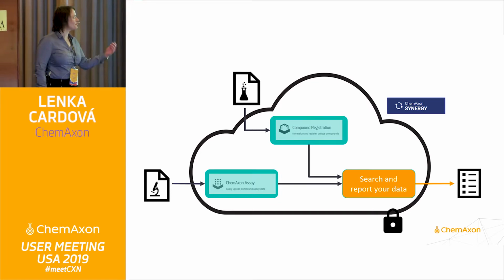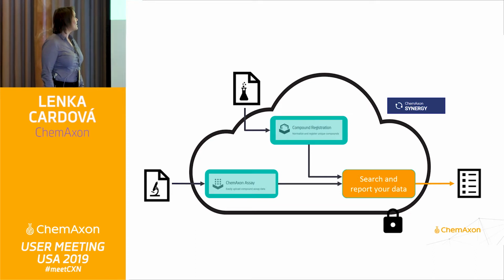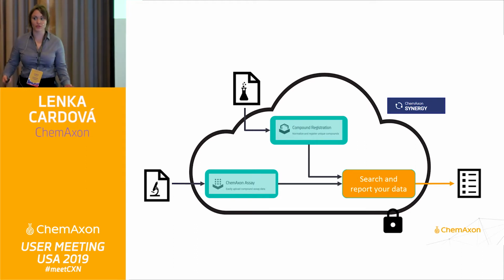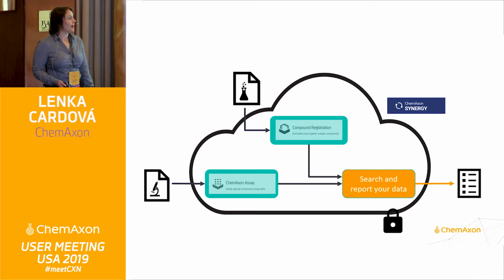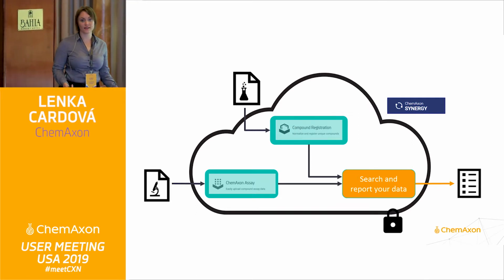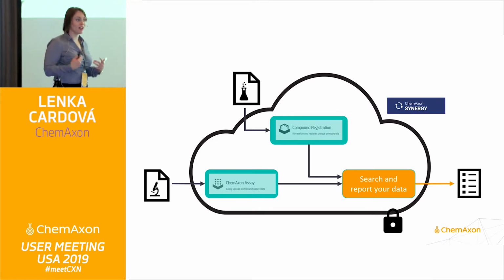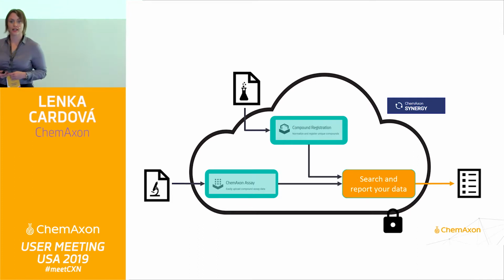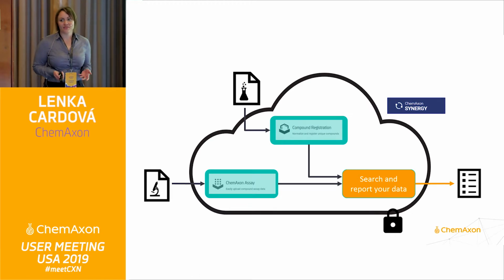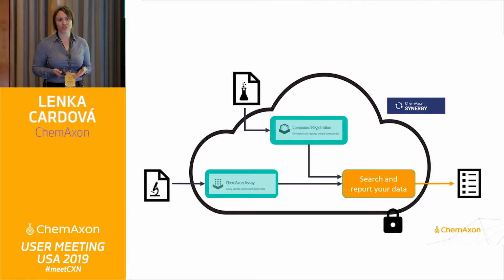Early in the morning, my colleagues Roland and Norby spoke about the compound registration and the way how to register your novel data, your novel compounds. Right now, you heard from Miklos about the way how to register the results of Assay screenings. Csaba, before Miklos, spoke about the synergy, one platform, one place where you can actually see all these points and all the data. But why? Why did we actually dedicate so much time to talk about the registration tools?